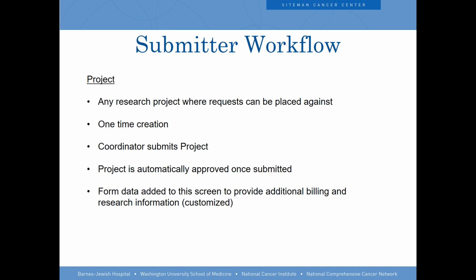So there's also flexibility in being able to place the specimens in the request, either manually, or to actually build a specific report or query around that. There's also the ability to turn off email notifications.